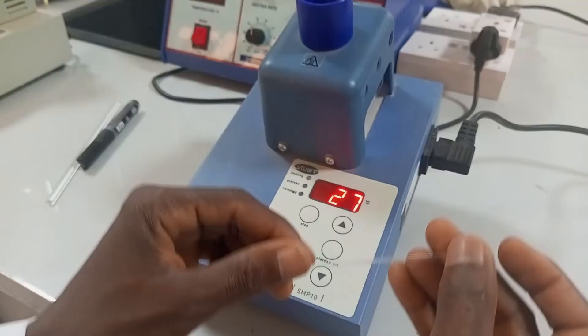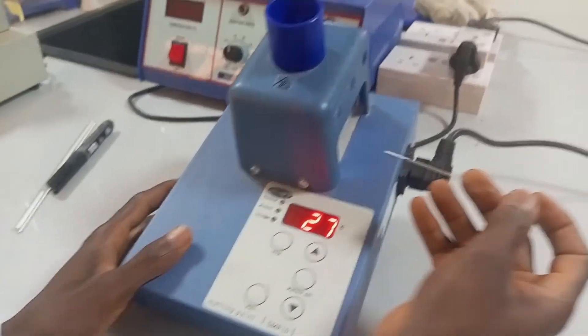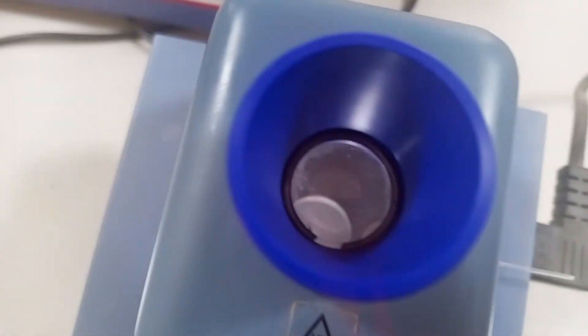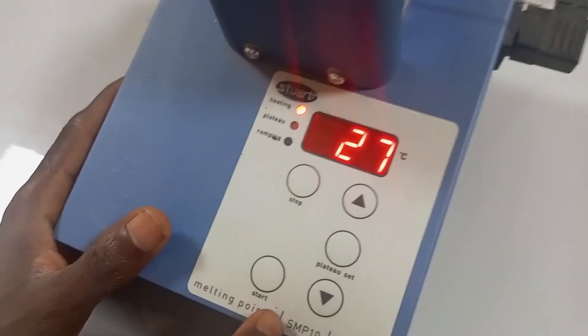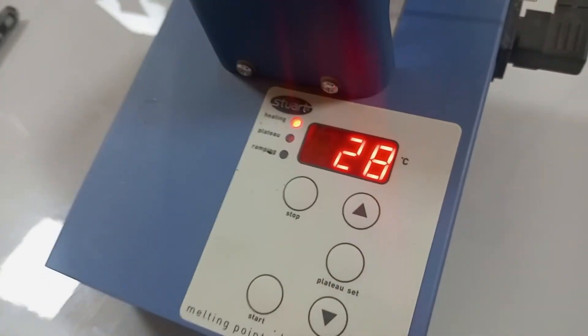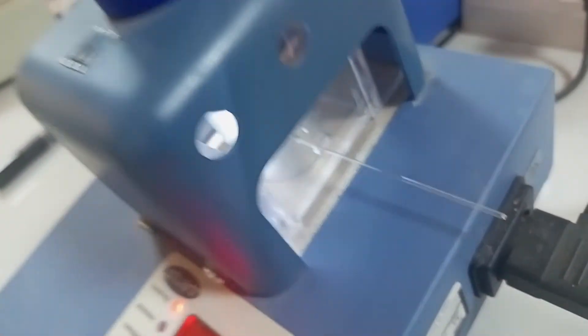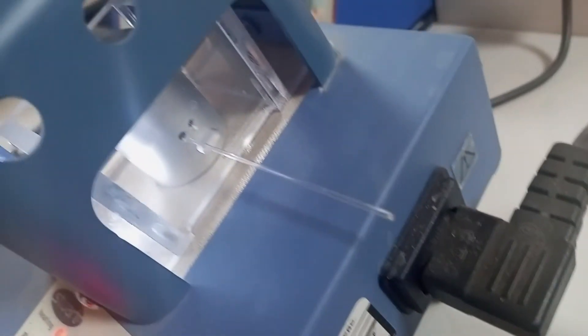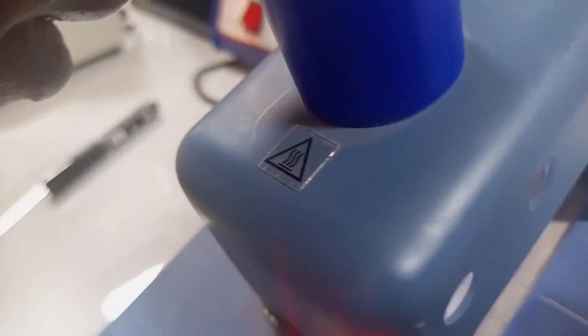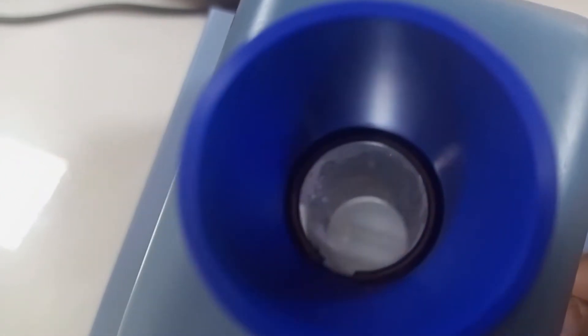Then, the next thing is to load the capillary tube, press the start button. You can see the temperature is increasing. While the temperature is increasing, you focus. You need to focus inside through the eyepiece to check when the substance will melt.